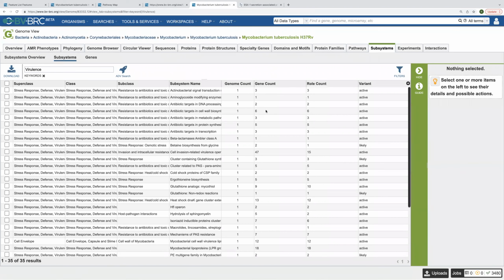What I particularly like about this is, when I'm in a KEGG pathway and it loads the KEGG pathways, it'll even have things like photosynthesis. If something has a particular EC number and it maps to the KEGG pathway for photosynthesis, we show that. But Mycobacterium tuberculosis H37Rv does not photosynthesize. So it might be confusing to someone who's not thinking about those things.